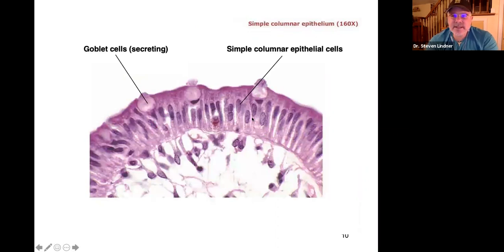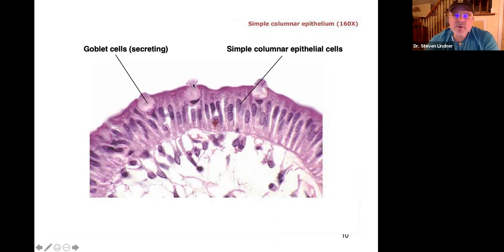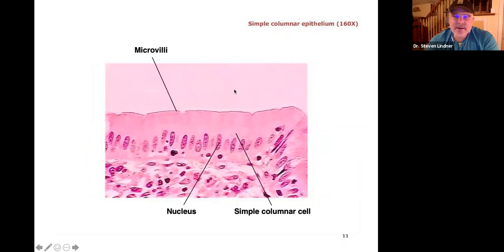In this picture, the columnar cells are easier to see. Here is a goblet cell secreting — you can see the mucus being released, which is called exocytosis. So these are simple columnar epithelium. You can see it's at the external surface, one cell layer thick, column-shaped: simple columnar epithelium.